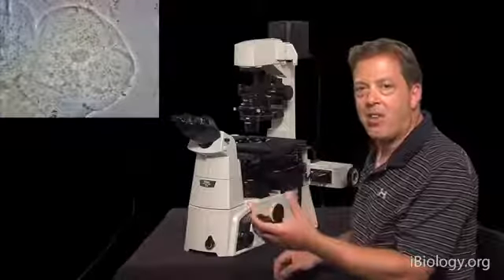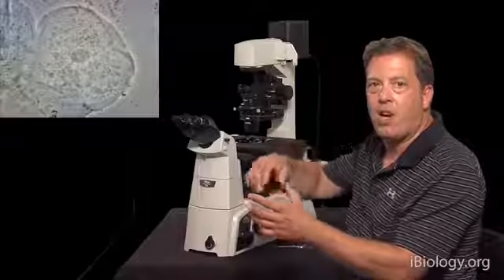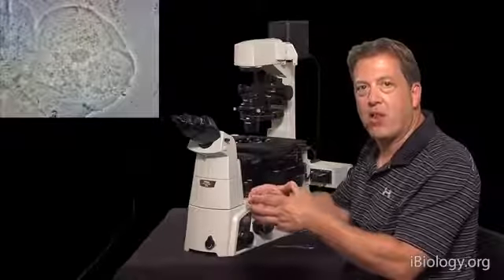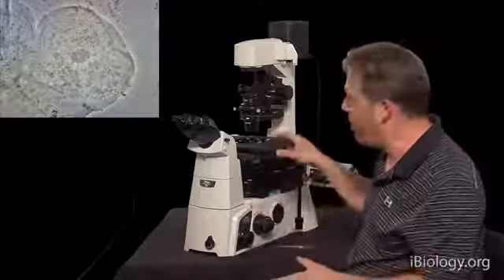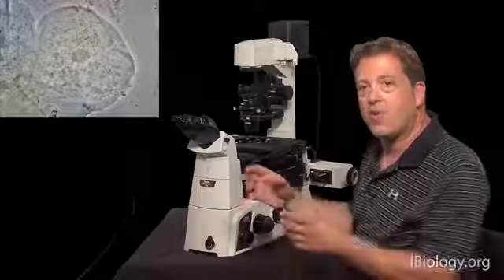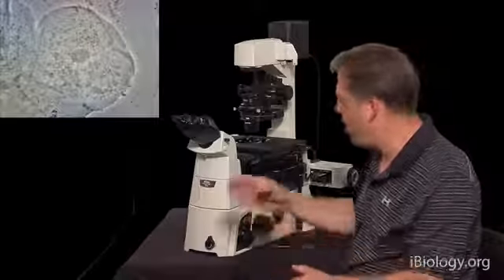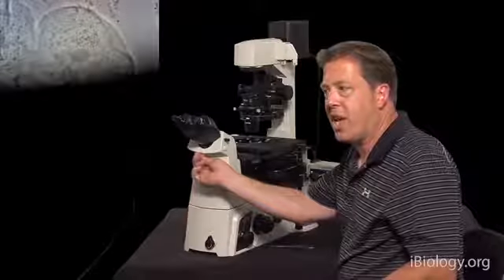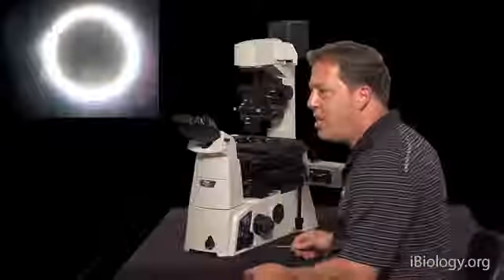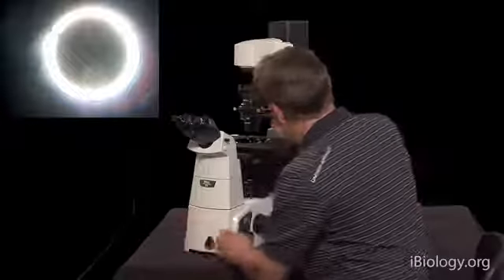The phase annulus restricts all of the illumination to a specific area, making the light that's coming through, your zero order light, hit specifically on that ring in the objective lens. So it's very important that that annulus and the ring in the objective lens be aligned as it is right now. And if we switch to the camera again, you can see that looking at the back aperture, here's our ring of illumination.